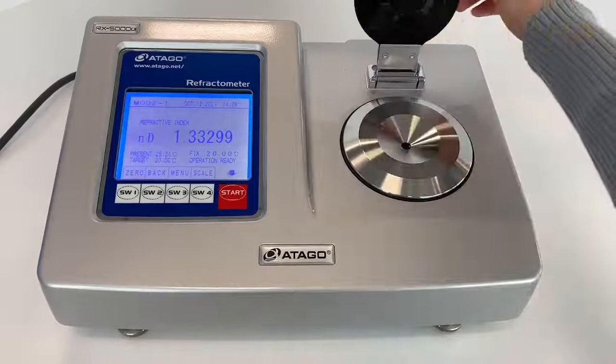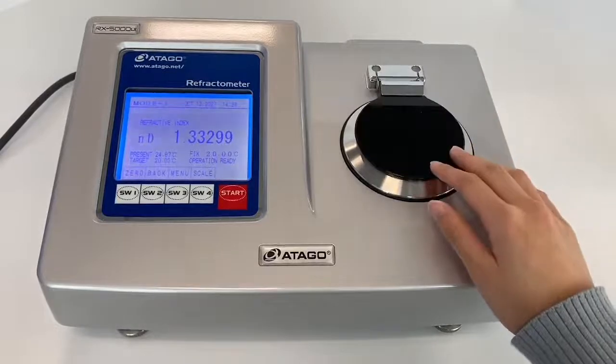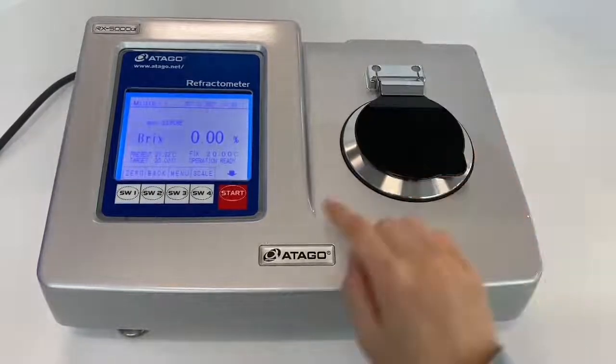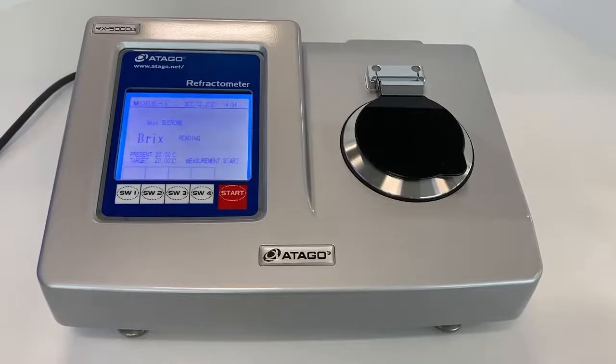Let's start from Rxα. You have the prism made from sapphire here, and zero setting. As you can see, you have to press the buttons — there are five buttons. Every time you want to change the screen, you actually have to click a button to change it.